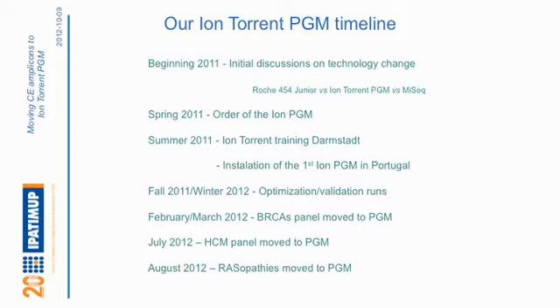And the story, it's not that big actually. It didn't start long ago. We began thinking about this issue in the beginning of the year 2011, and it was by the summer of last year that we got the PGM working in our lab. We spent the next few months trying to get a feeling for the technology and to see how things worked in our hands after having the training in Darmstadt. And since then, we've been slightly and consistently moving different panels that we had running in the lab to the Ion Torrent PGM. And those you can see on the slides.